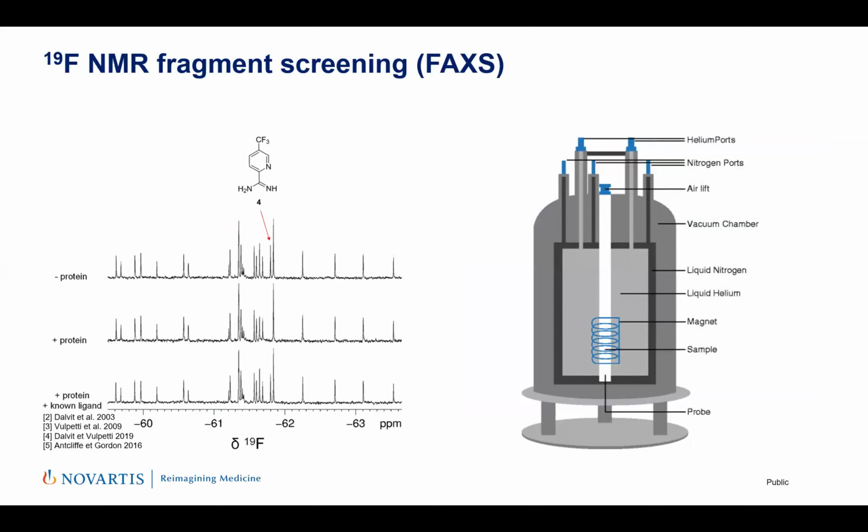We had an introduction to NMR-based screening yesterday in Thomas's talk, so I won't go too deep into that, but this is how our spectra look on the left here. Then we will go with just the cursor. So here at the top is a mixture spectrum of a bunch of compounds that we put through 19F NMR. The 19F, which is the most abundant fluorine isotope, is the atom giving us the NMR signal. And each one of the peaks that you see in the spectrum roughly corresponds to one compound.